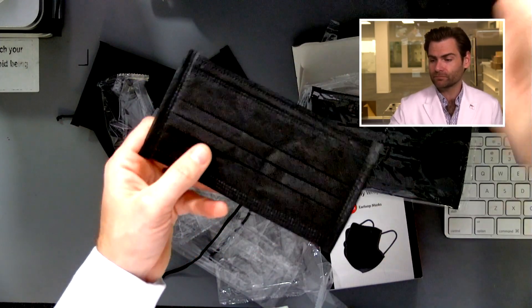Sorry, Premier. Let's try it on — if I can get it to stay on without breaking. The ear loops are actually nice. It's a super, super thick mask — so thick that the spun bond is making it hard for the nose wire. If this mask has carbon in it, that's actually an interesting move because I cannot smell a thing. The carbon just completely eliminates any smell. That's pretty cool.